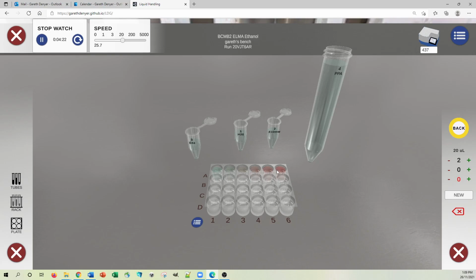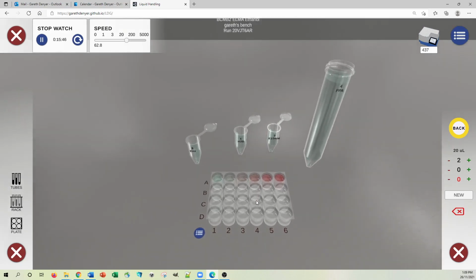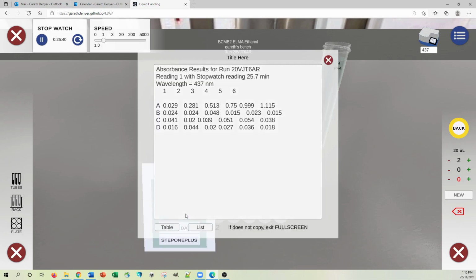And you can see some colours developing in these wells. Let's actually take it up even further. And we can view what's happening from the top. We can see a very nice colour gradation there. So that's pretty nice. I think the reaction should be pretty much done by 20 minutes. So let's just take the speed down to one again. Let's measure the absorbance of that.